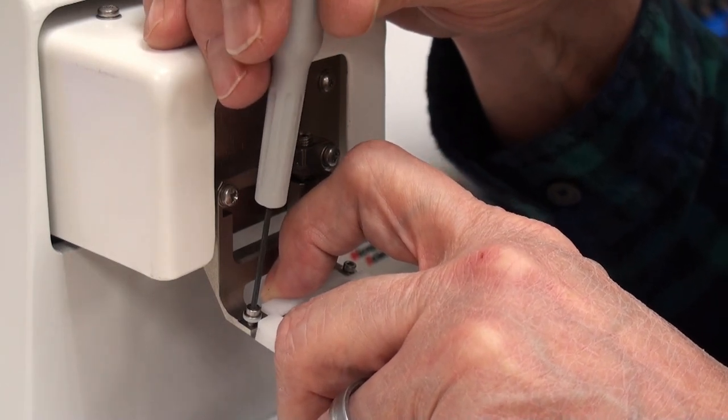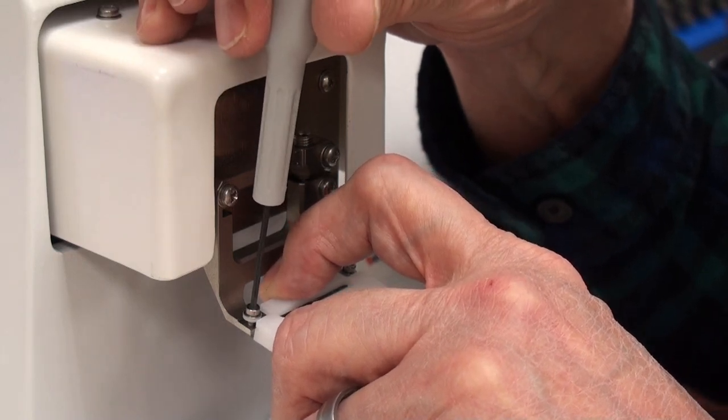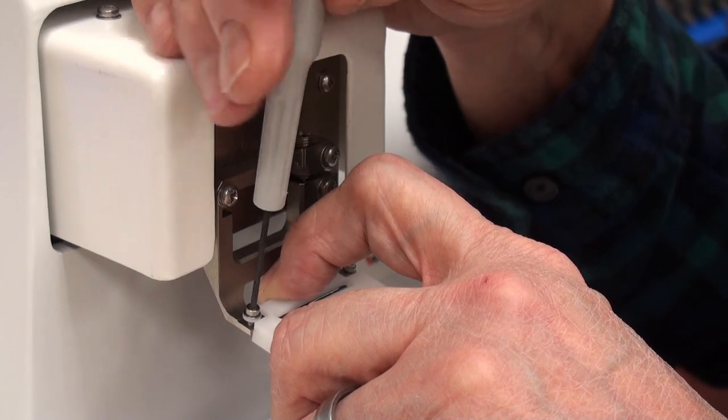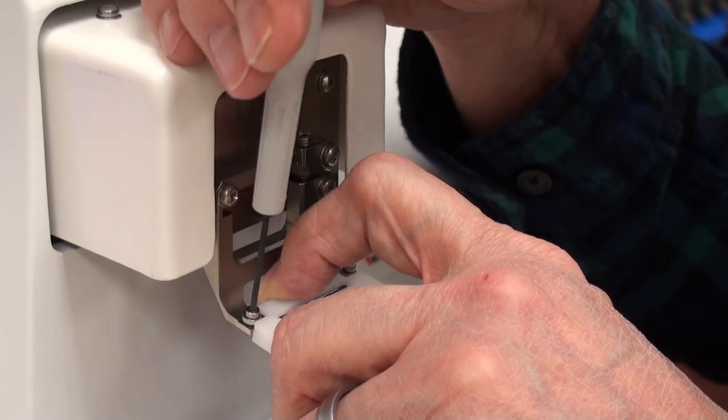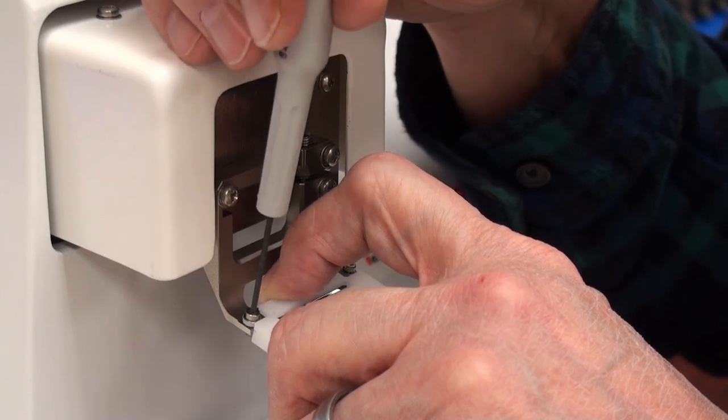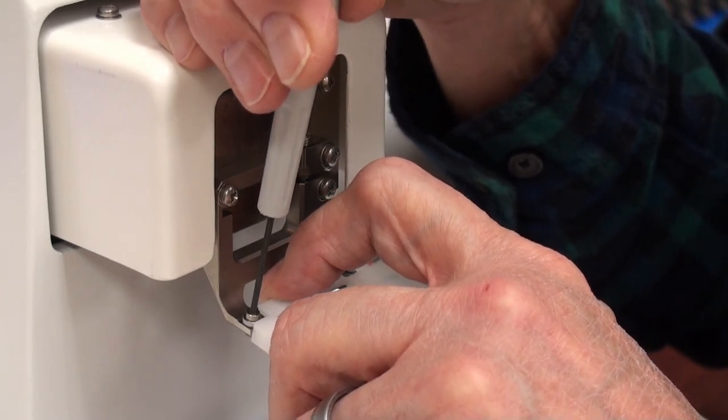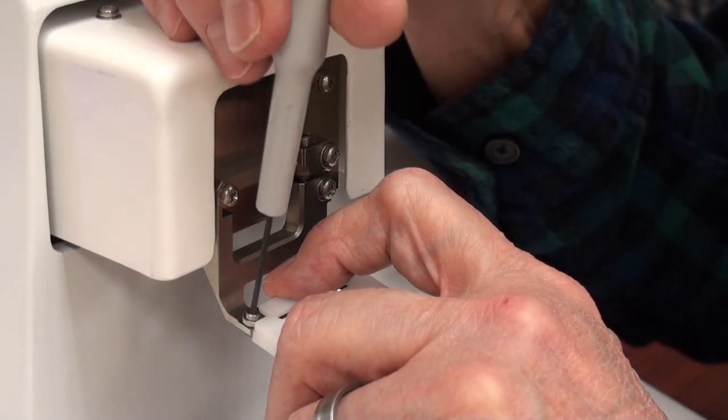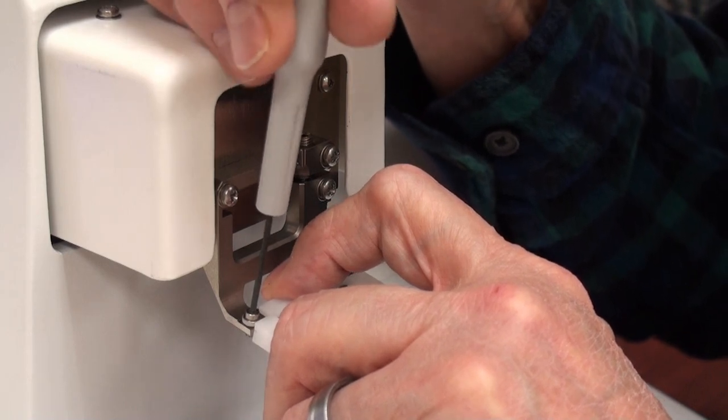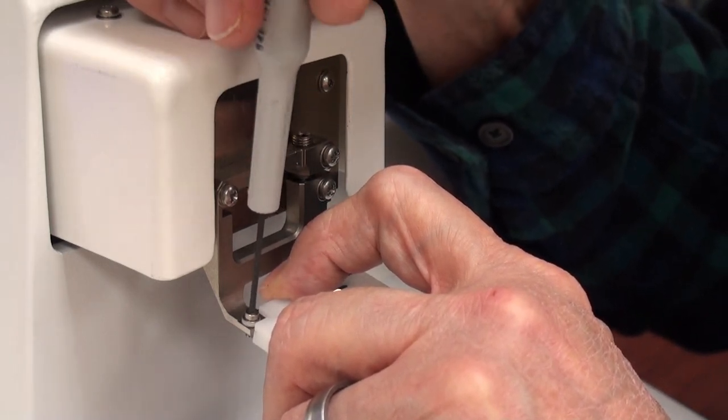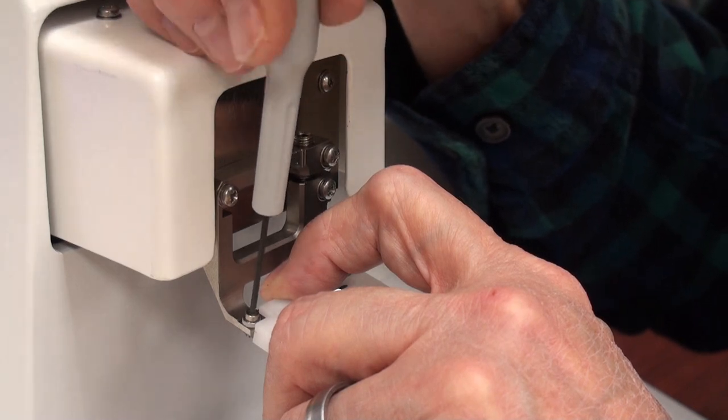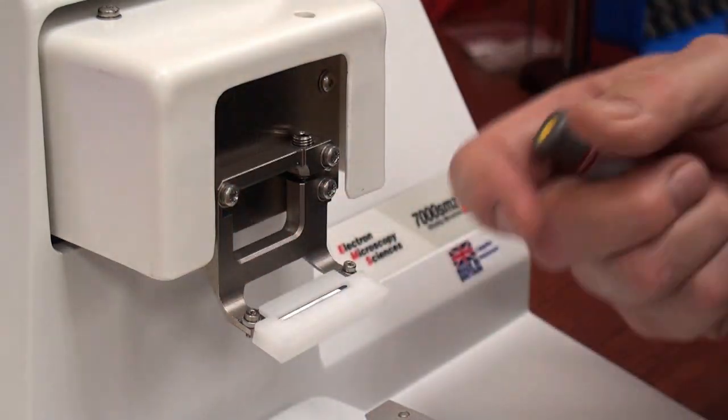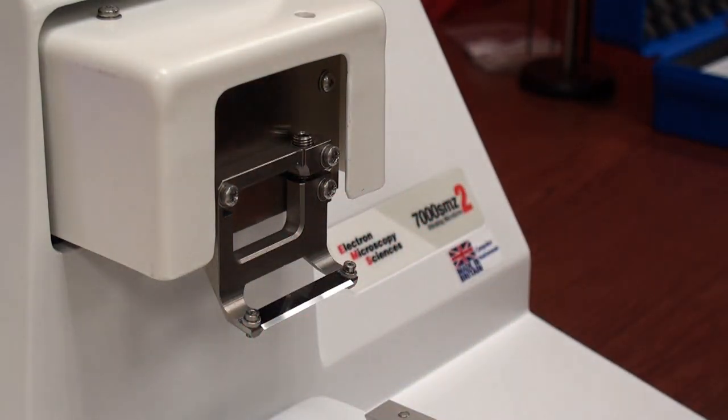You want to make sure that the blade is on the little shelf. There we go, it just dropped into place. So it's lefty-tighty on this one, righty-tighty on this one. And once the blade is mounted, you can remove the cover.